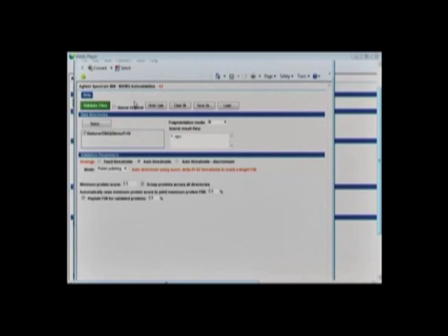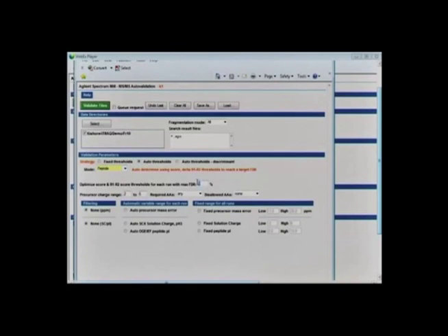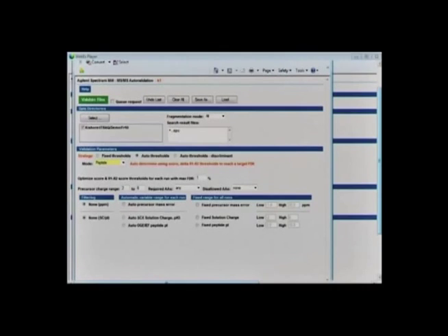Auto validation. In auto validation, both peptide and protein validation need to be performed. First, we will do the peptide validation by selecting peptide in the Mode tab, 1% FDR, and remaining parameters are set as default. Click on Validate the files.